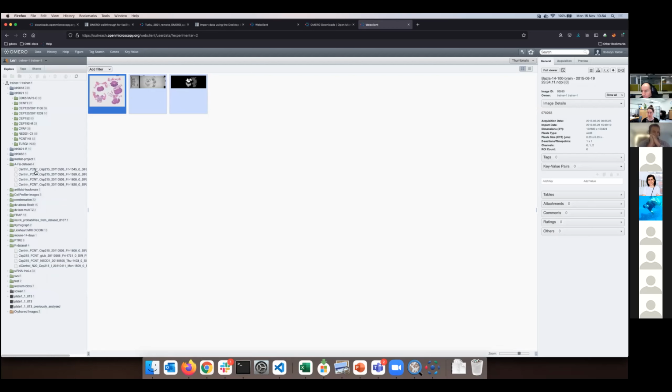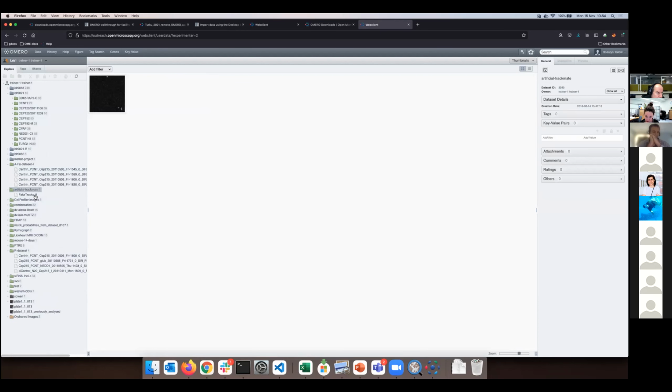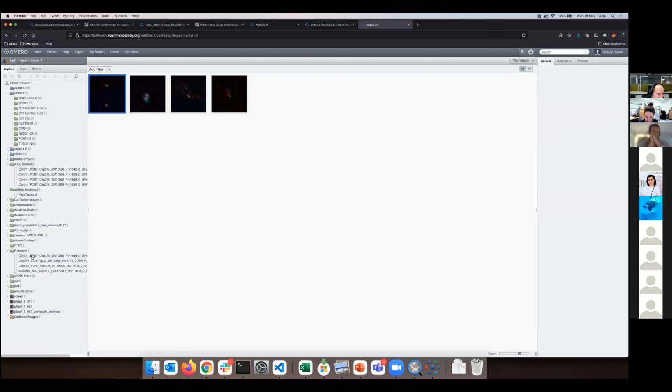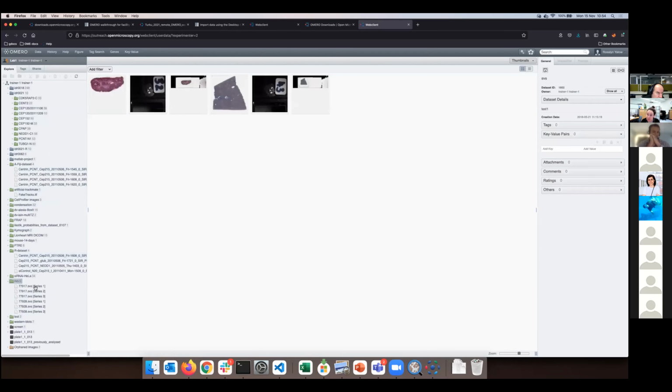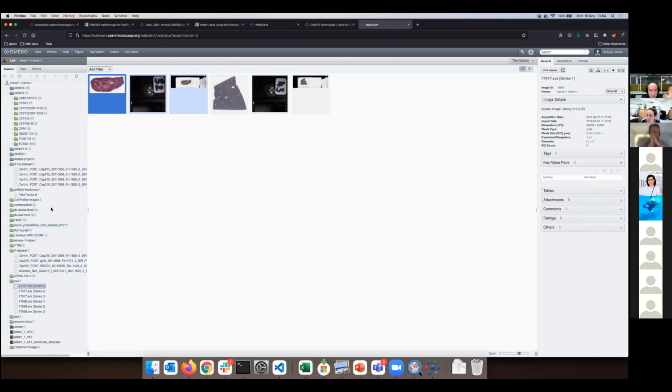It's NDPI, so another format than the TIFFs I was showing to you right now. You have some DVs here, Delta Vision. You have again yet another type of very large images. We support time-lapse and Z-stacks and multi-channel images, and this is what we call a 5D image. So if I say image, I don't mean what we call plane in Omero. I mean the 5D structures. So multi-T, multi-Z, etc. It's still one image in Omero.